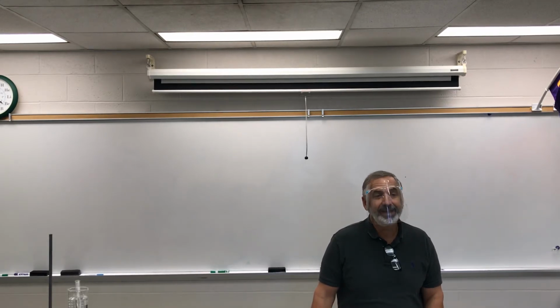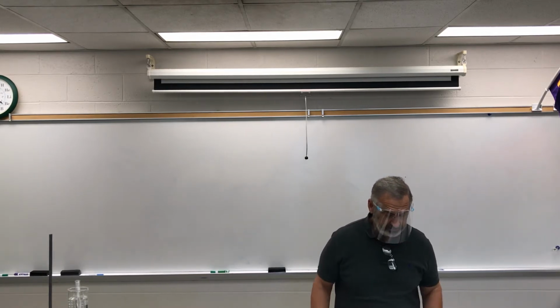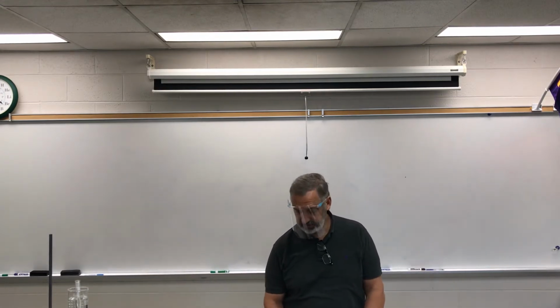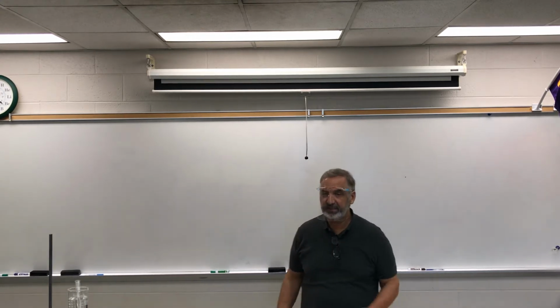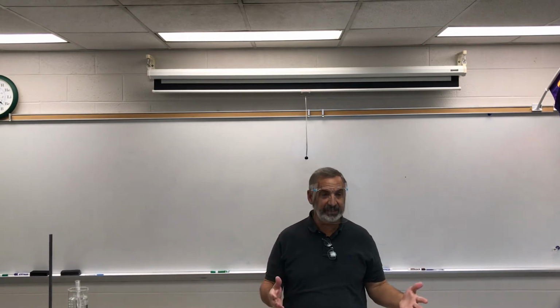Today we're going to be doing a lab. It's called Beer's Law Lab. As you can see in the handout in front of you, it involves spectroscopy. What do you think spectroscopy measures? What does spectro sound like? Spectrum, which is light.